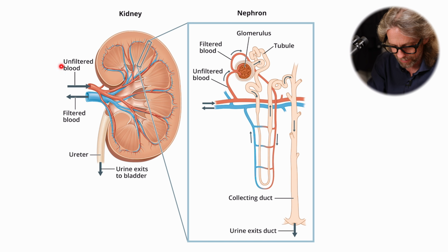Here's our kidney. It sees a lot of blood. Blood comes in and blood goes back out again. Out here we've got the cortex of the kidney around the outside, and then we have the medulla, the medullary pyramids, and here these spaces are collecting the urine. So we're really interested in what happens to the blood and the fluids and how they get in here.